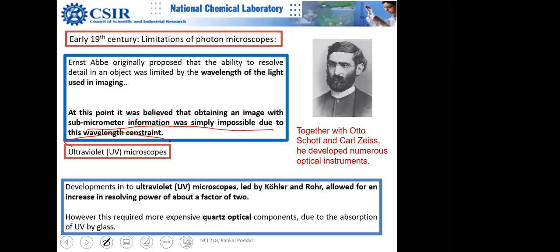But उस जमाने में basically we didn't have any radiation, because X-ray बहुत बाद में आई है ना, X-rays came much later, and even today we don't have X-ray microscope because it's not possible to make optics for X-ray. You cannot make lenses. Converging, diverging X-rays, it's a difficult task.